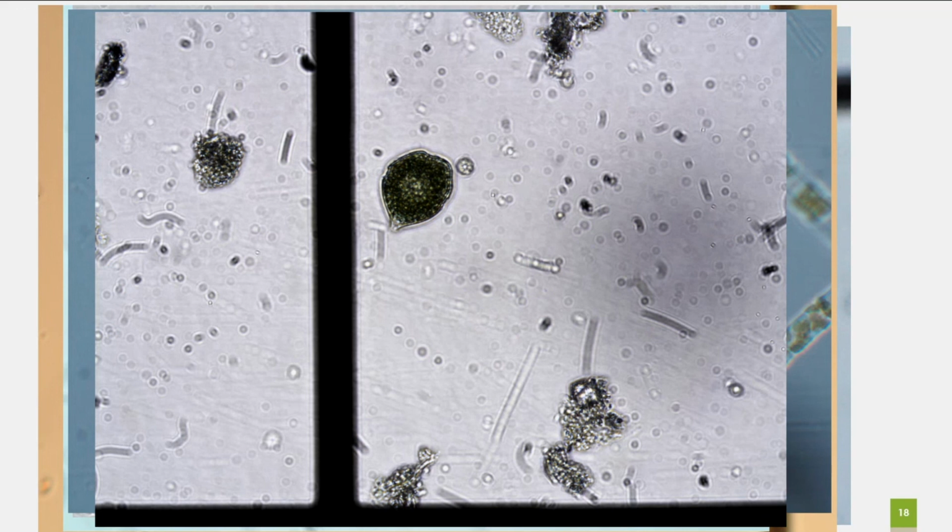If you were in different parts of the Gulf of Maine, Alexandrium catenella are present everywhere, and they all produce saxitoxins, but the congeners that they're producing closer to Nova Scotia are very different from the ones down by Mass Bay. And this becomes a problem depending on how you're testing for the toxicity. We in New Hampshire are like savages, and our test is the mouse bioassay test. So they shuck the mussels, we grind them up, they boil them in acid, they extract it, and then they inject that into mice.